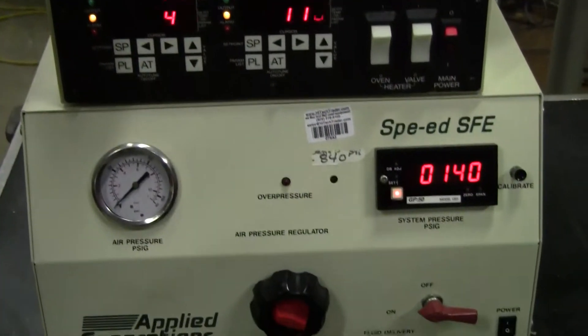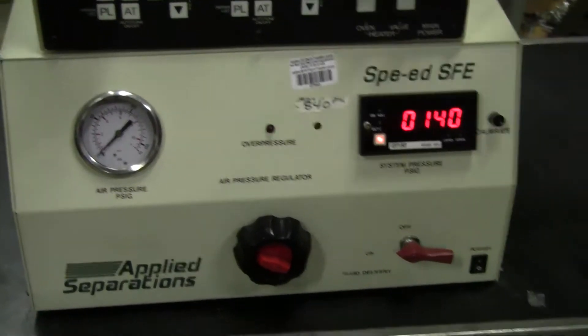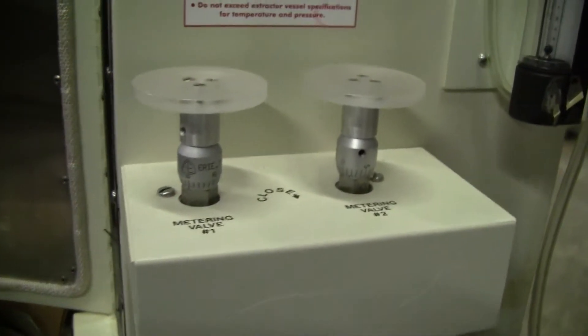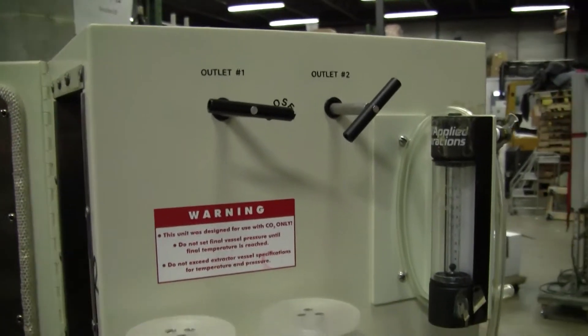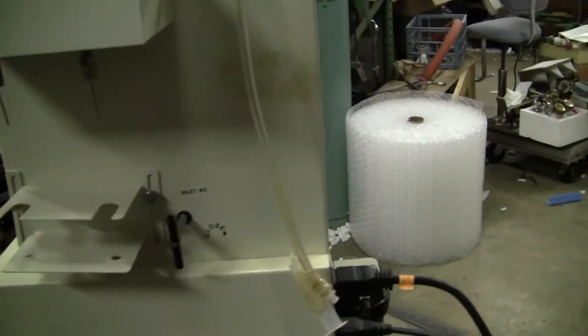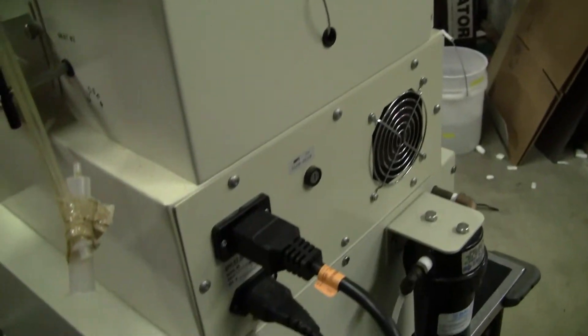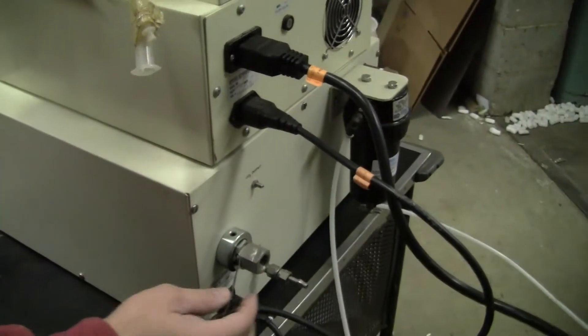System pressure. Let's take a look at the rear of the unit — just look at the side. There are two metering valves at the rear of the unit. It is 115 volts, but it's a 20 amp plug.